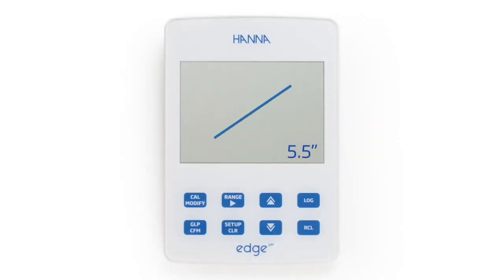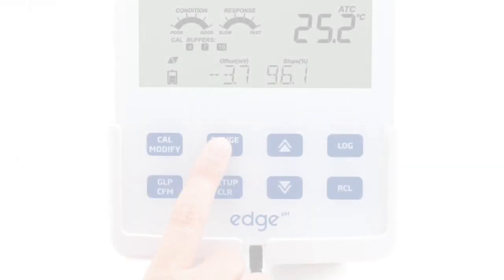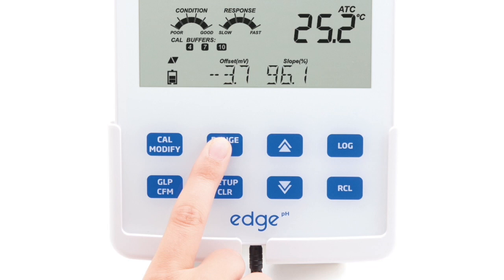This meter features a large 5.5-inch LCD display and dedicated keys for basic meter operations. It incorporates capacitive touch buttons which are clog resistant and easy to clean.